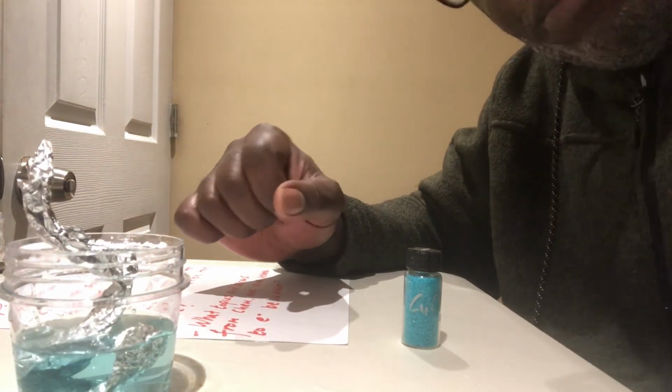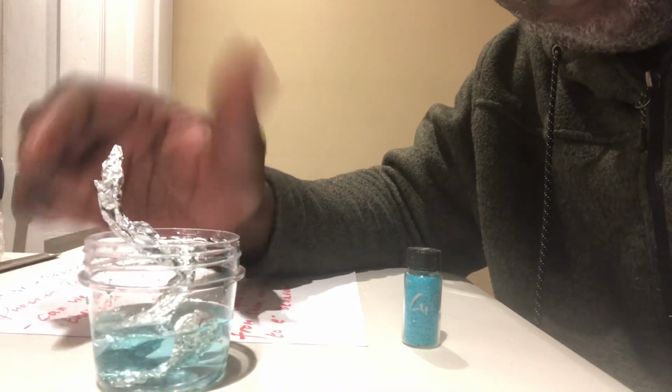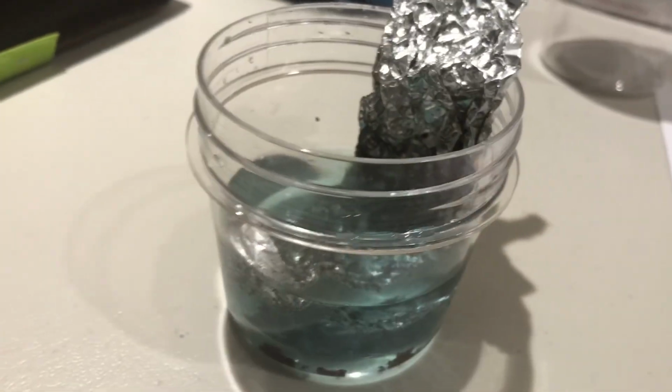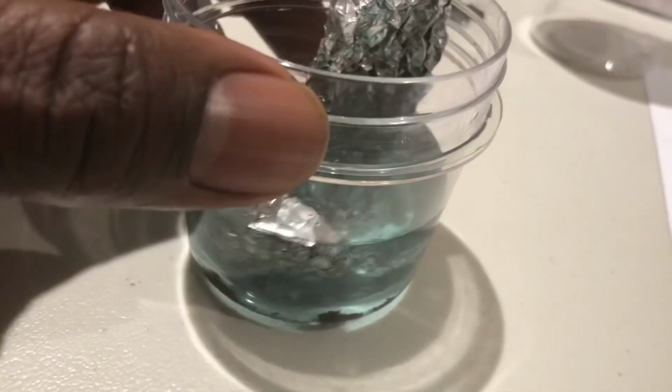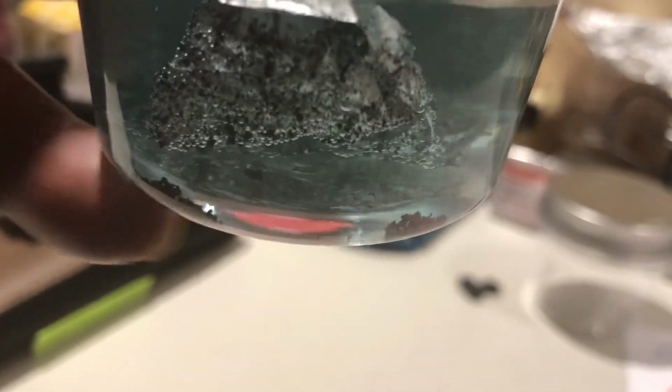And I will be back, folks, to see what happened, if anything, to the aluminum foil in the aqueous copper chloride. All right, guys, I'm back, and the demo is back. So let's check it out. If you look at this carefully, folks, let me hold it up at a better angle. Do you see anything in the bottom there? It looks like brown residue in the bottom right there.